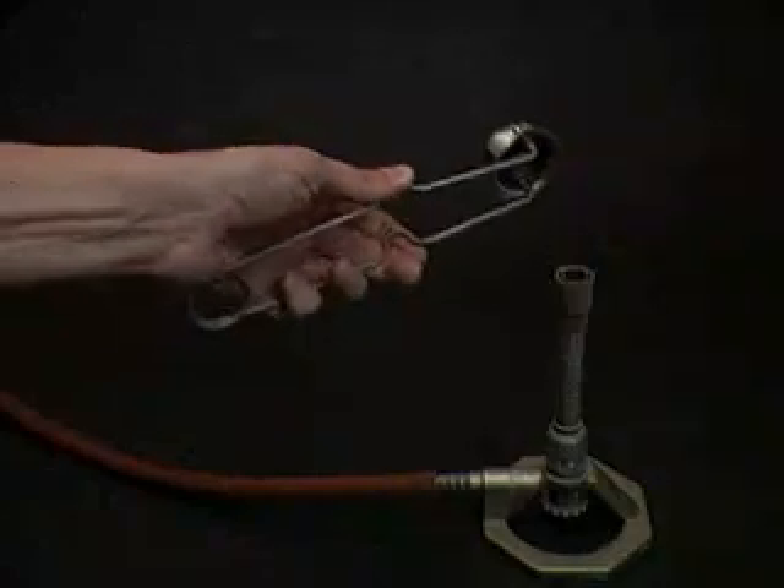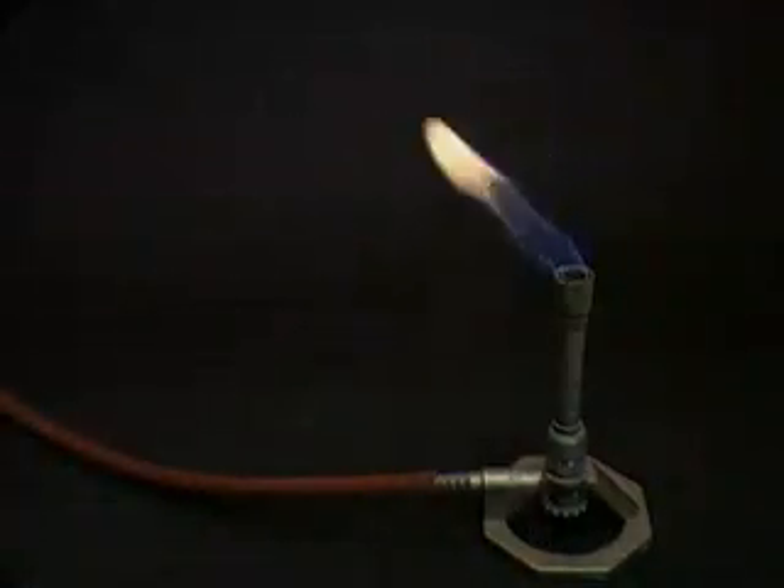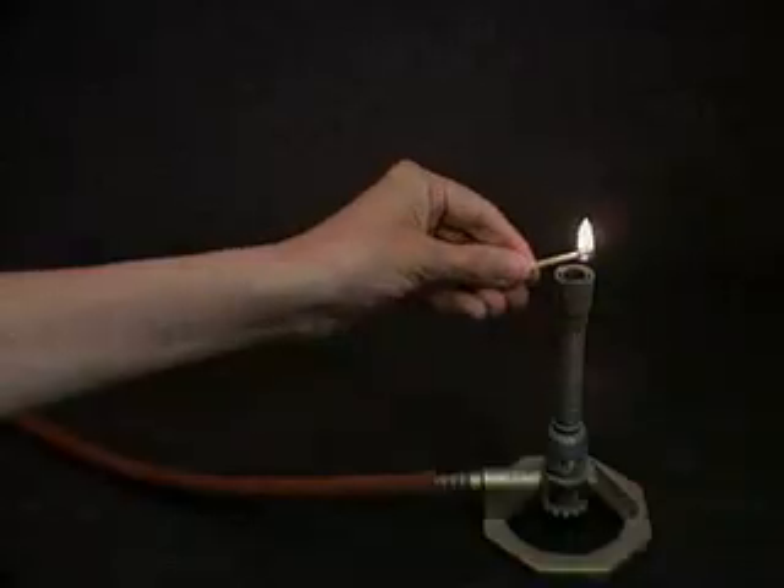Squeeze and release the striker until a spark ignites the burner, or use a match to ignite the flame.